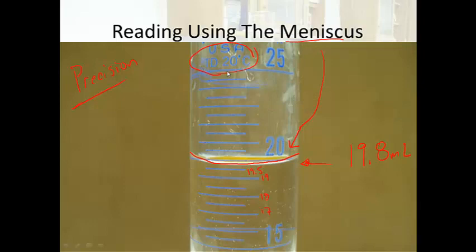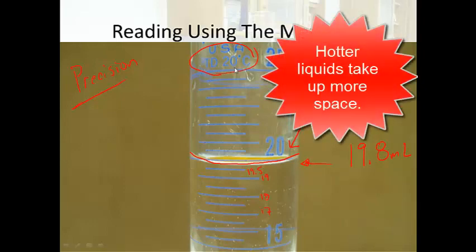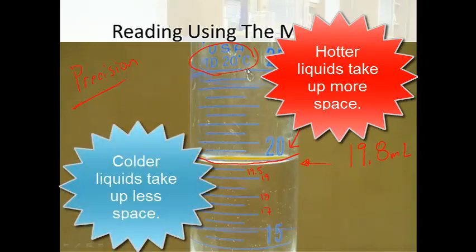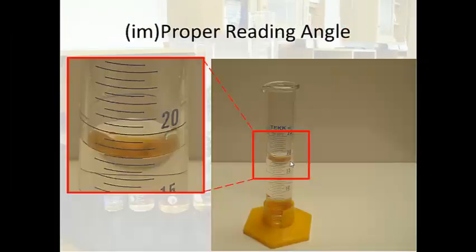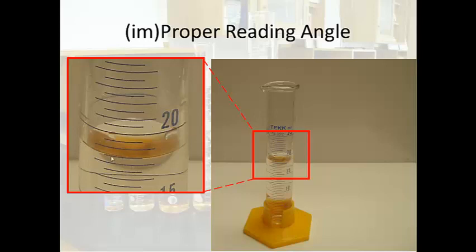Another important thing to note is right up here. This device has been graduated so that it is correct at 20 degrees Celsius. So the liquid inside of it needs to be exactly 20 degrees Celsius, otherwise the reading is going to be off by a slight amount. So sometimes that can cause a little bit of trouble in labs. Sometimes we get a little bit of error because the liquid that we're measuring isn't exactly 20 degrees Celsius. It's really difficult to read a meniscus when you're above it. If you're at an angle, a normal angle from the tabletop, you can see here that it's really difficult to tell where the meniscus actually is. So when you actually read a graduated cylinder or a beaker, any glassware as a matter of fact, what you need to do is you need to get your eye to the level of the meniscus in order to read it properly.